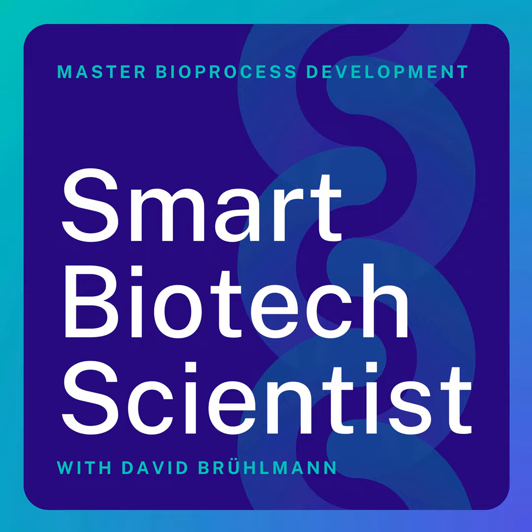I think that's key. Getting a small scale process as early as possible, choosing an equipment that might have some kind of linear scalability, getting it optimized at a small scale, and then it's not that hard to scale it up anymore. What I think is key is know what you need from the very beginning of your product and process development. Yeah, smart biotech scientists, remember that.